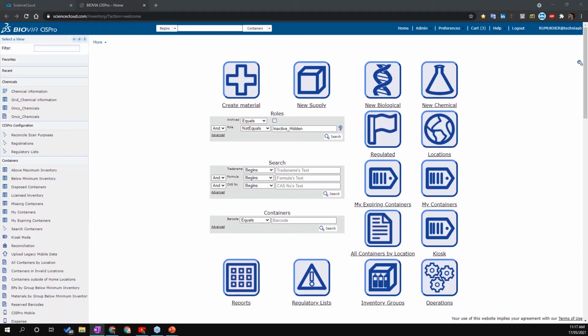Here, when we source materials, as a scientist who's working in the lab, I need the ability to quickly view the details of materials. This could be safety information, net quantity, etc. Also, we need to search for different materials for our projects. Now, those may be from the internal stockroom, or it could also be from an external catalog. Now, let's look at what it looks like within the system.